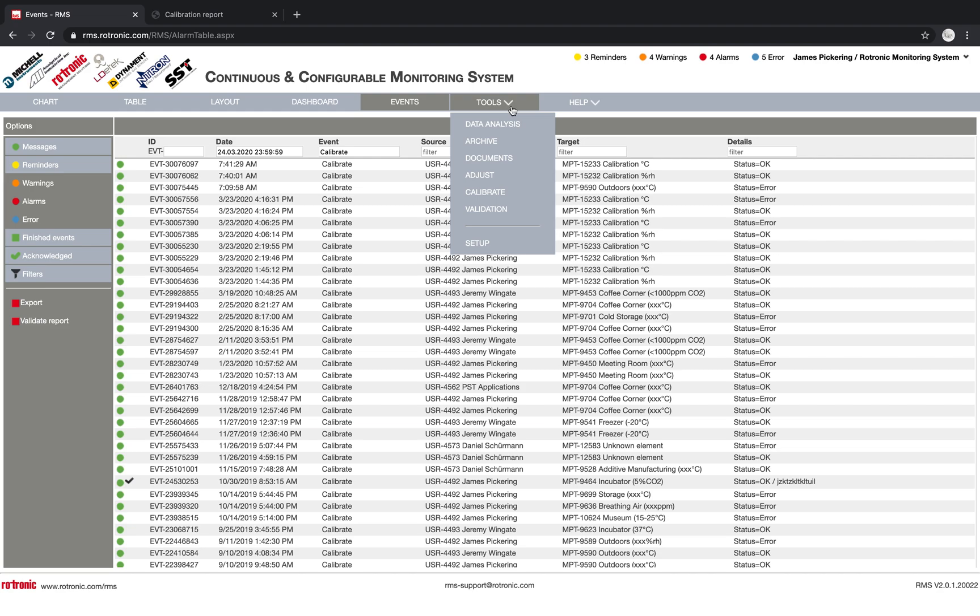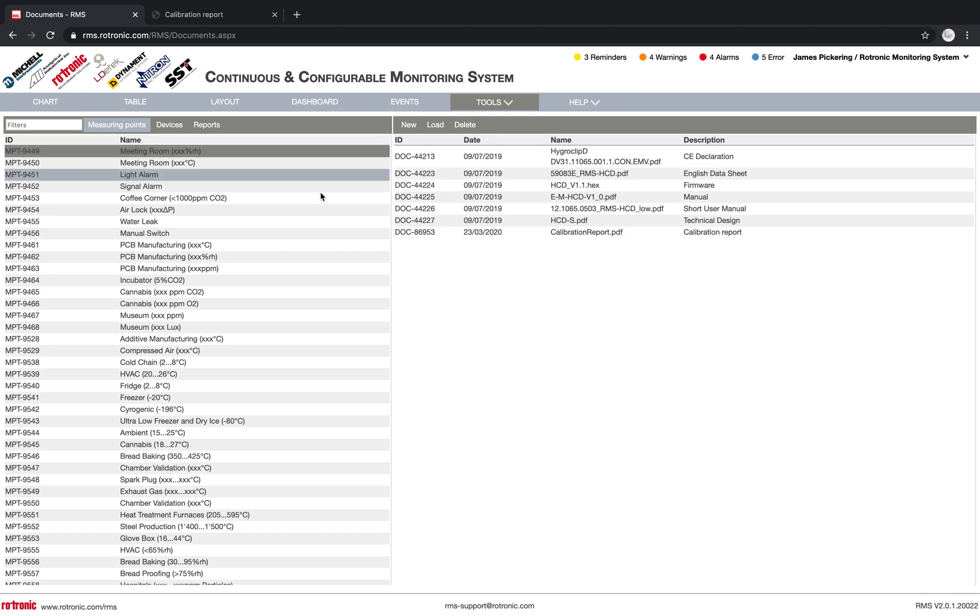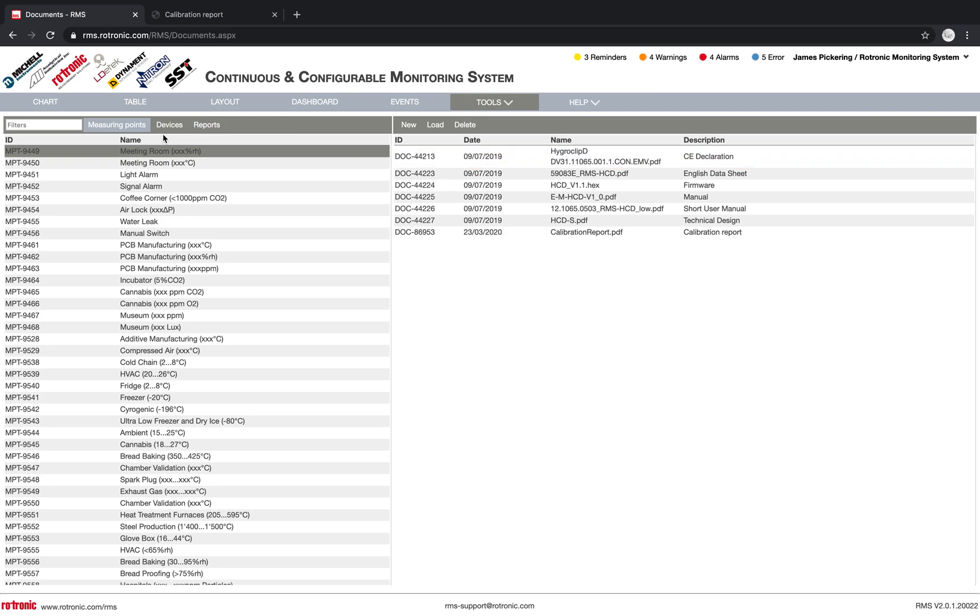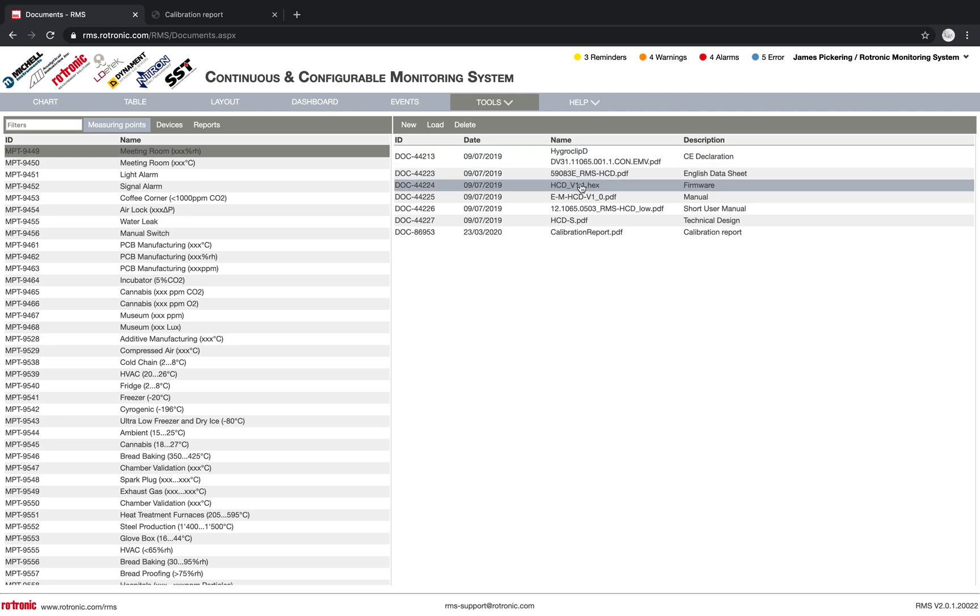We could then head into our document overview here. And then under the document overview, for example, we have the possibility to add information. So here on this MPT 9449, we can see that we've uploaded a HygroClip D, CE declaration, a data sheet, a firmware file, a manual.